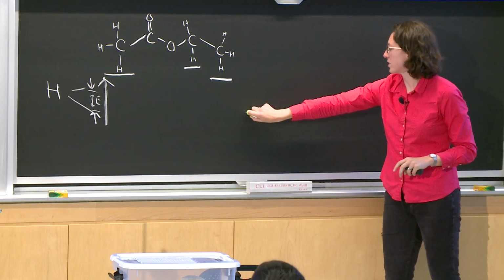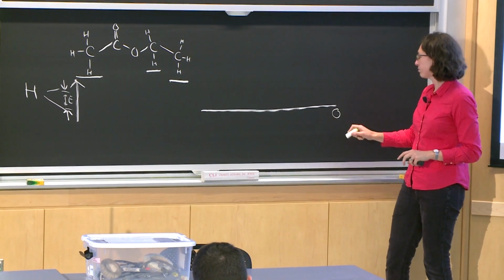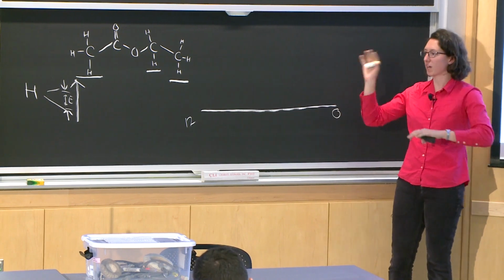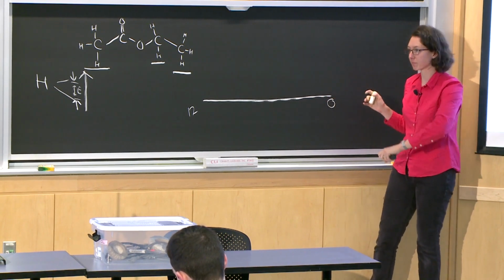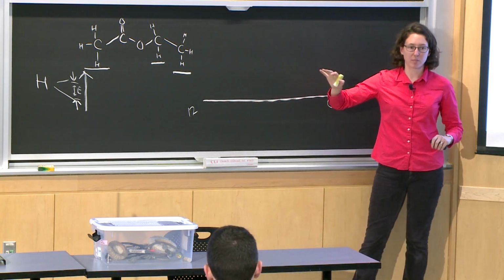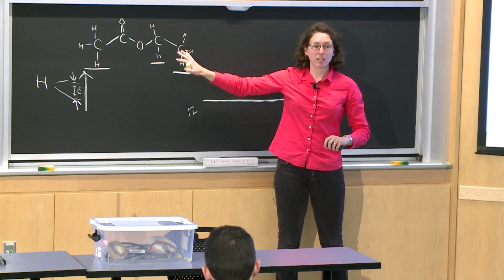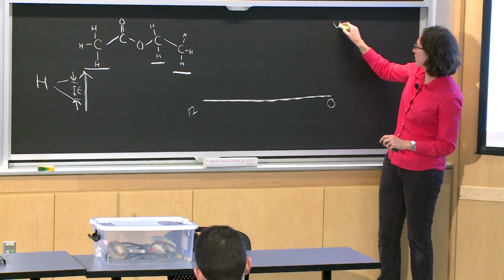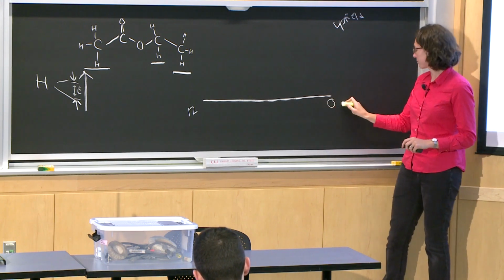So the way that an NMR spectrum is laid out, it's on a scale of 0 to 12, give or take. It can go beyond that, but for the purposes of most organic molecules, all of the peaks will be found in this region. And the location that a proton peak appears is again related to its chemical environment. And the things that are very alkyl or just have a lot of CHs around them are going to be further upfield. We call this upfield, with a lower ppm number.